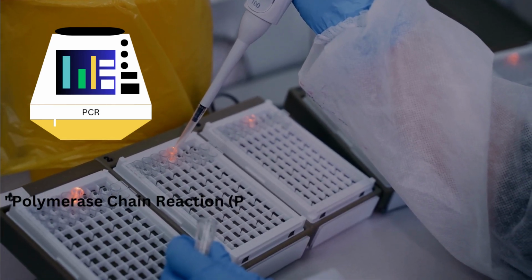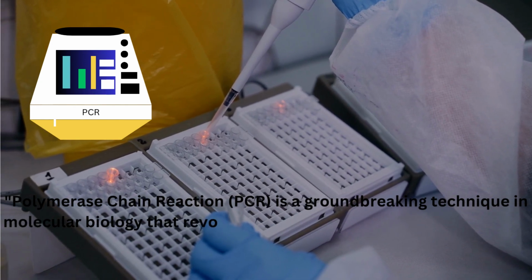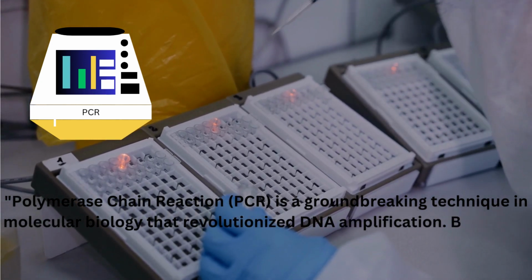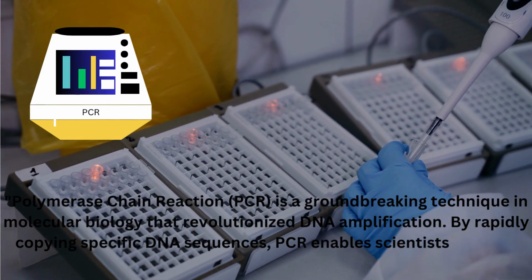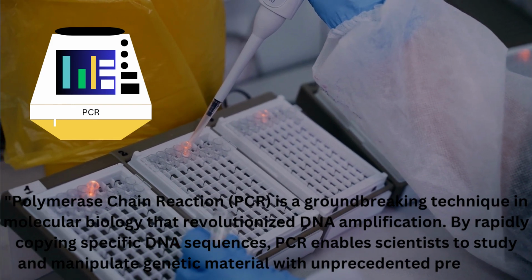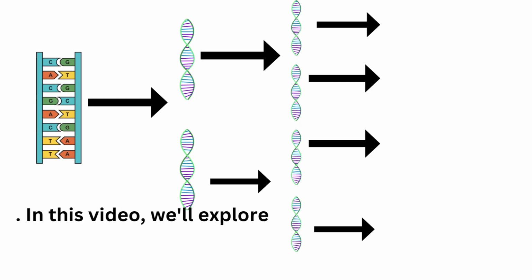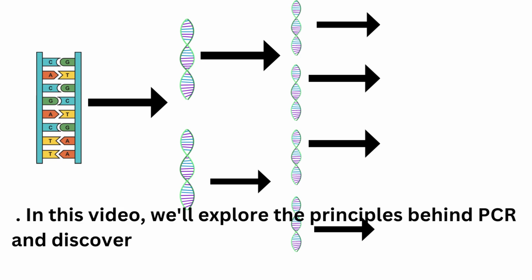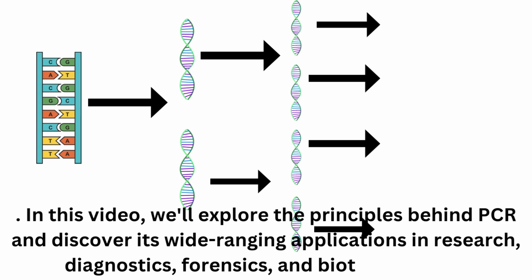PCR. Polymerase chain reaction, PCR, is a groundbreaking technique in molecular biology that revolutionized DNA amplification. By rapidly copying specific DNA sequences, PCR enables scientists to study and manipulate genetic material with unprecedented precision. In this video, we'll explore the principles behind PCR and discover its wide-ranging applications in research, diagnostics, forensics, and biotechnology.